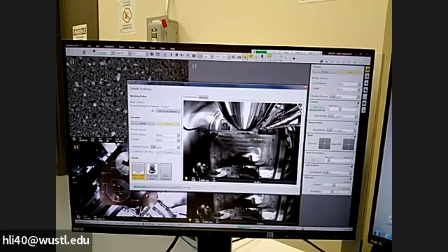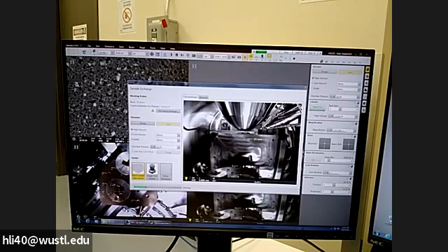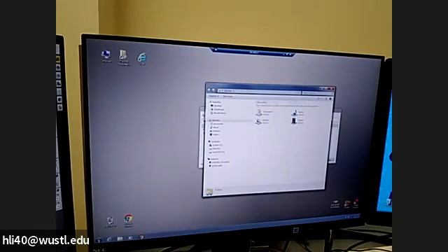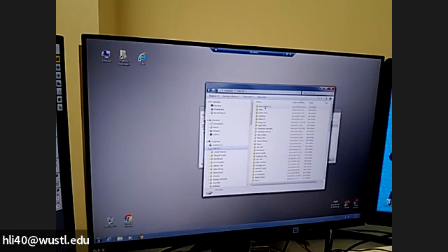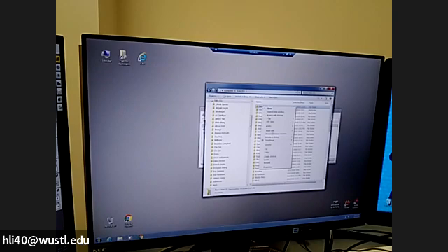So first we find your data. If you click the Windows key, you will see the folder here. You just go to folder. When you click it, a lot of the time you will jump to the right screen. So it's here now. Okay. So you go to data and find new folder. This is a folder I took today.